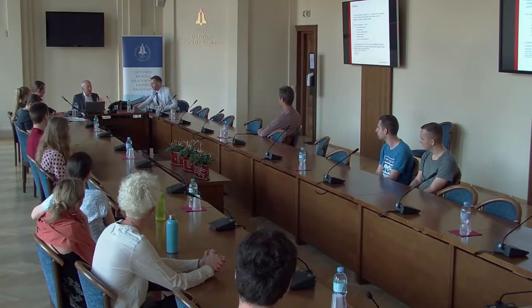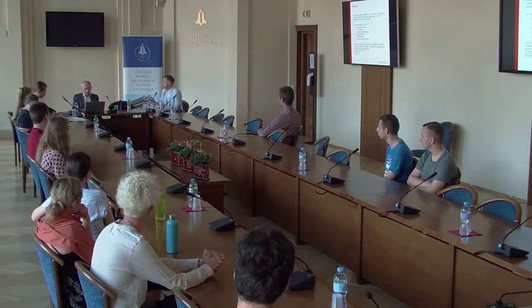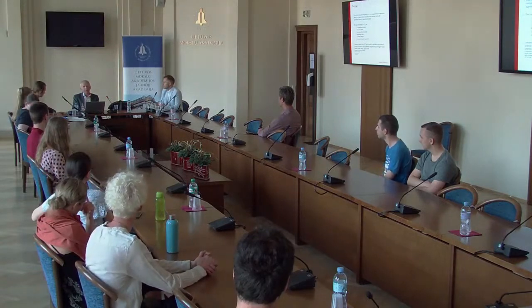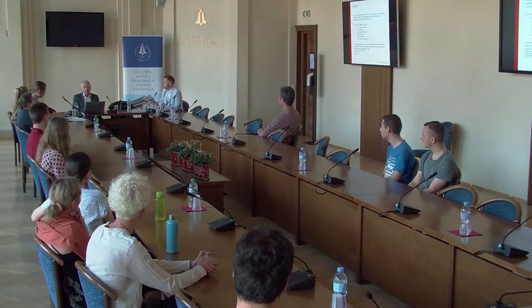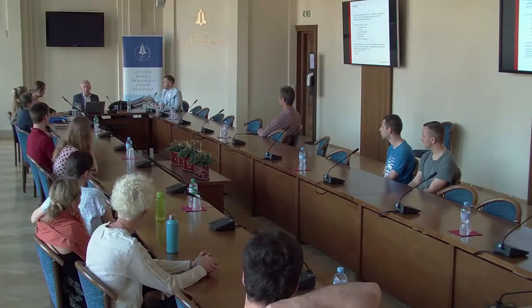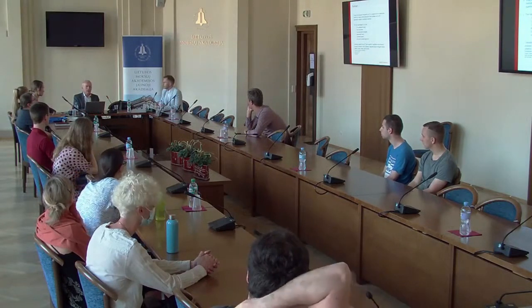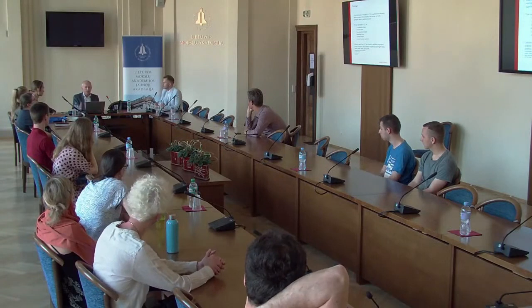Costs are, sorry, we are a shared facility, so we have a user fee. CT for us is, well, everything is relative, but my instrument is $25 per hour in the daytime, $15 per hour at night. It depends on the resolution of your sample, how long you will scan. Practical measurements can take from 2 hours to, say, 24 hours. Above 24 hours is probably not practical. Below two hours is probably too fast. So usually within that range.